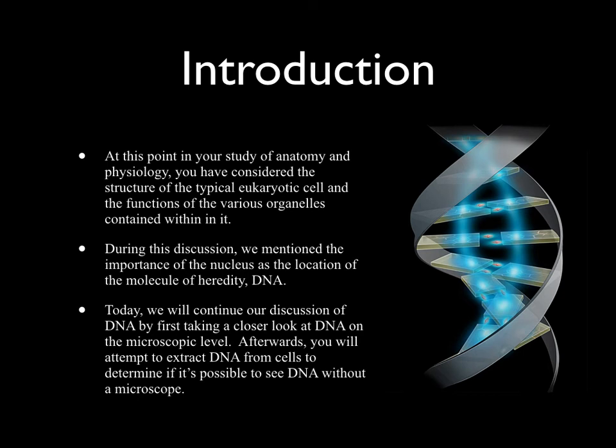In this lab, you'll learn more about DNA, examining its microscopic structure. Afterwards, you'll complete a hands-on experiment in which you attempt to extract DNA from cells to see if it's possible to look at DNA without the use of a microscope.